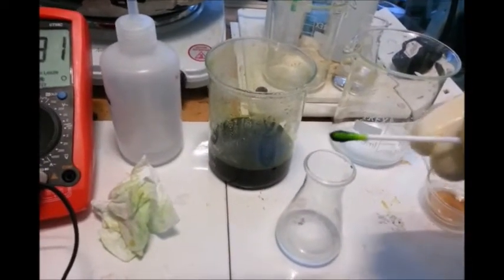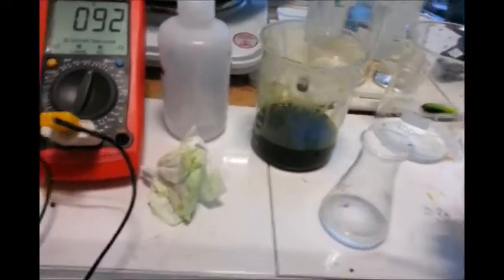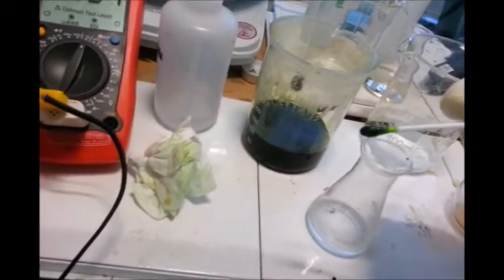So now I'll prepare to do the final stages of separation — filtration — and then we'll precipitate out the gold.